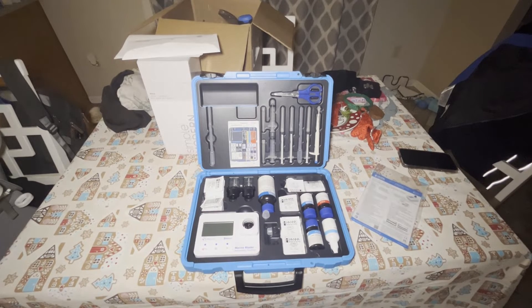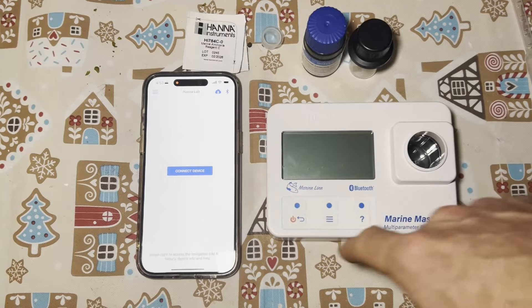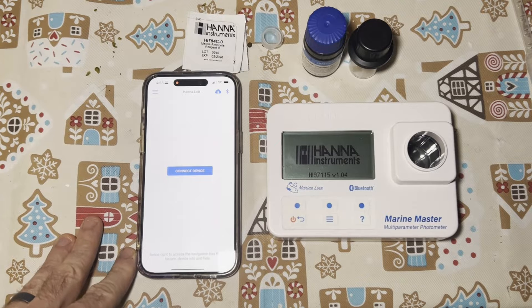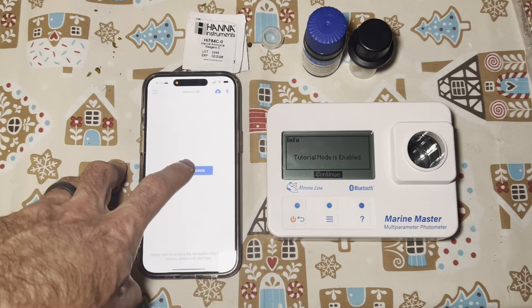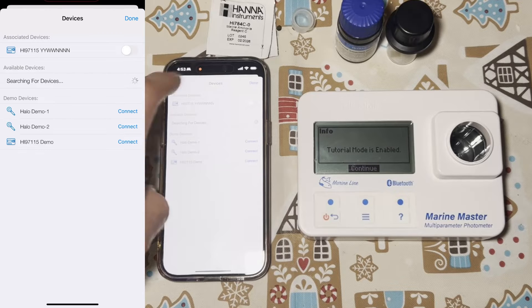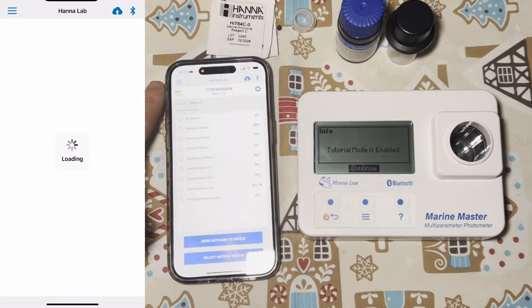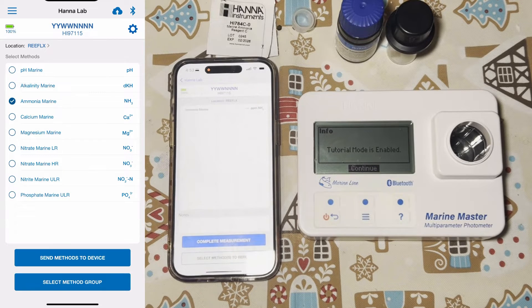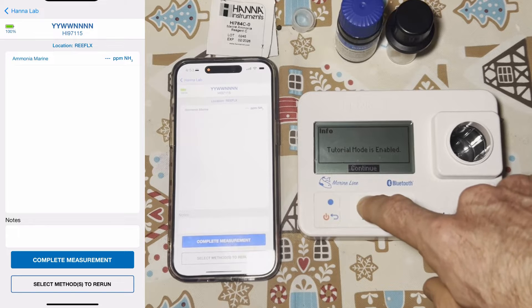Let's go ahead and run through an ammonia test. I'm going to power on the marine tester, connect the device, scroll down and select ammonia marine, and say send methods to device. At this point we are ready to do all of the testing, so I'll hit continue.